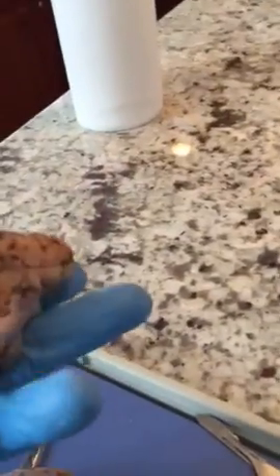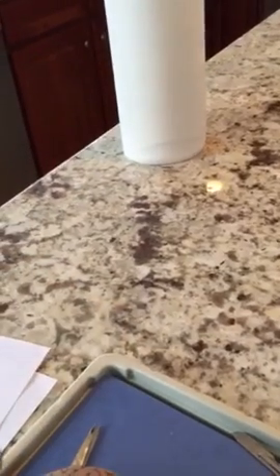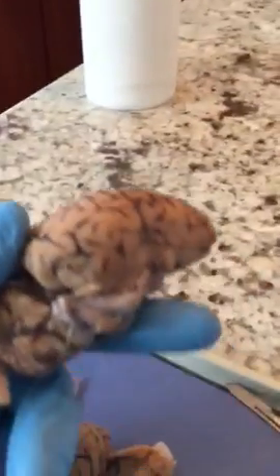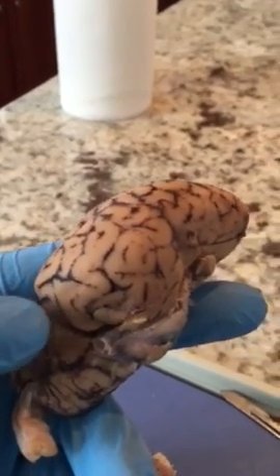You know what the problem was? I located these before I did my sagittal cut, and now it does not look the same to me. So I'm just going to have to take those on the chin for right now.